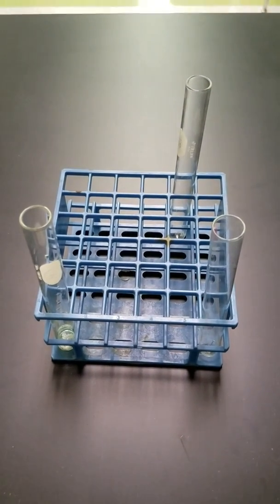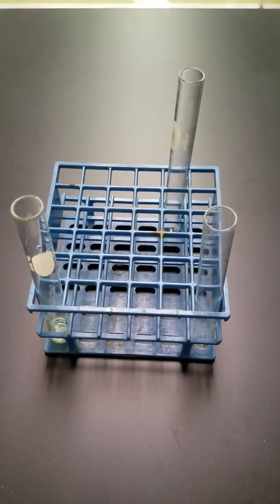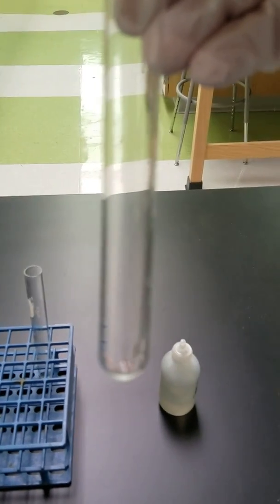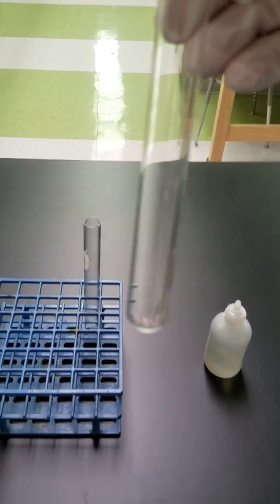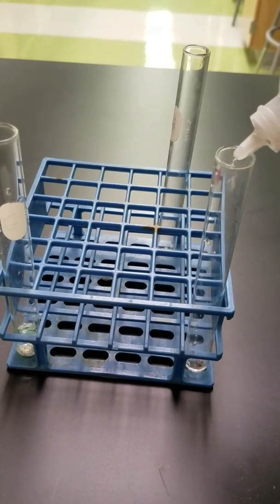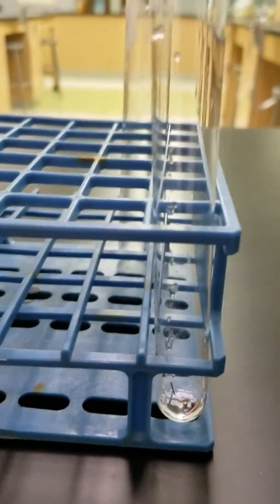In this video, we're going to demonstrate single and double displacement reactions through some actual experiments that we can do here in the lab. The first one we're going to do is single displacement. We've got a piece of copper metal, and to it we're going to add some silver 1 nitrate solution, and allow the two to mix.